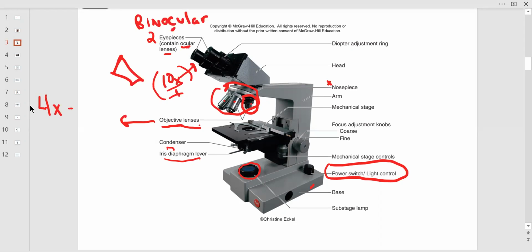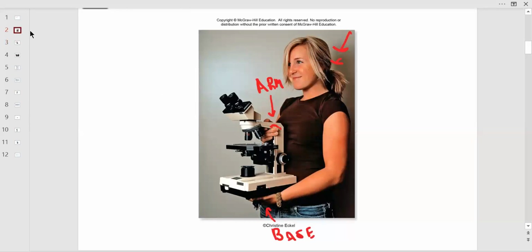And we don't call that low power though. Be careful. It's called scanning power. Scanning power. That's two N's. Scanning power. So listen to this, it's really important. Like, remember the lady taking the microscope out? Now, when you put this away, that microscope should be in scanning power because it's the shortest objective lens. It should be in scanning power. And that's where you want to start too.